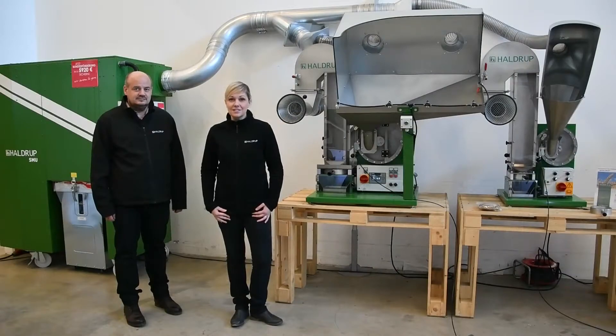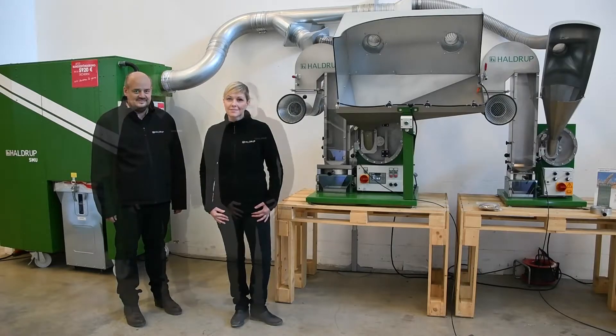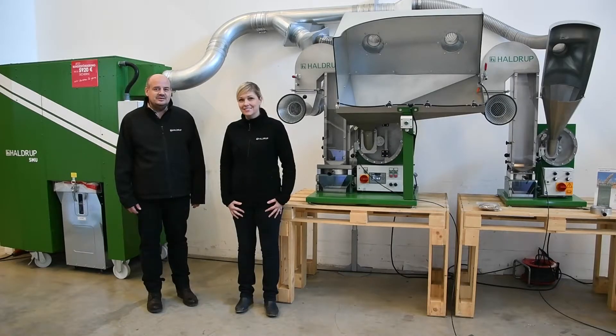This dust extractor is very powerful. Therefore it can also extract very fine dust and create a very healthy and dust-free environment for the operators. It is possible to work without dust where work health and safety come first. It is also possible to add it to already purchased machinery.